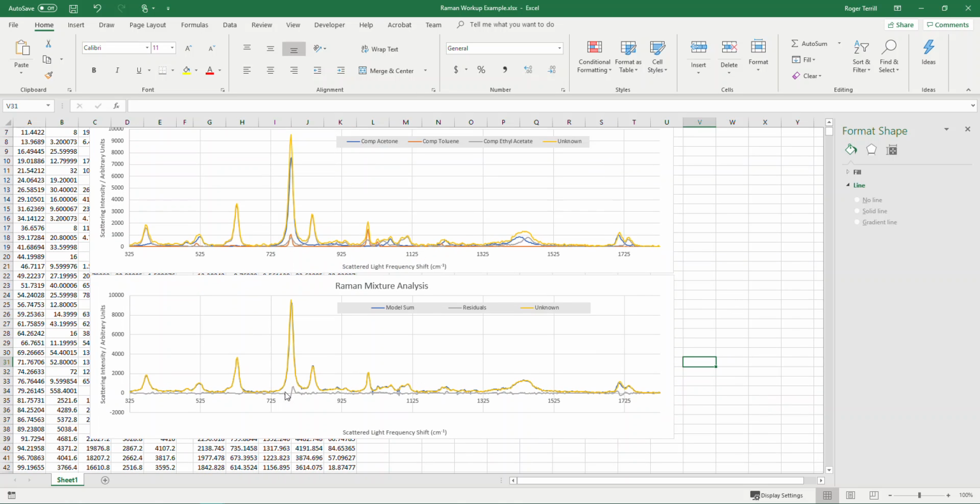So that's slightly solvatochromic, we might say. It has a slight shift in wavelength as a function of frequency. And there's another similar shift over here, right? But basically, this looks really good.